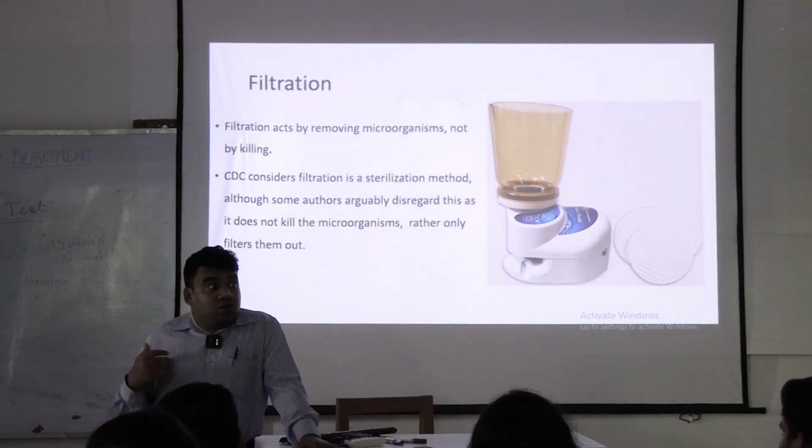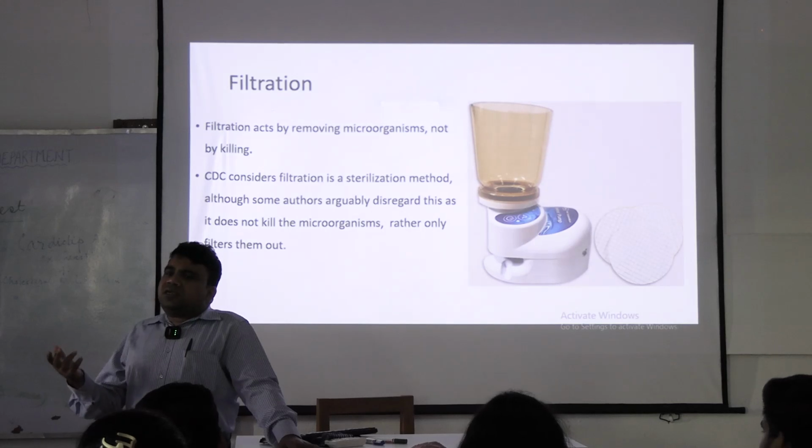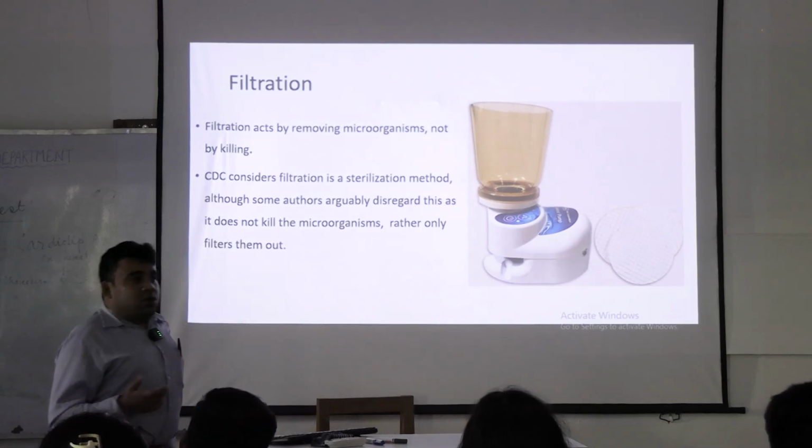There are main colloidal suspension, not normal saline. Normal saline does have water and salt. You can easily heat it. Okay.